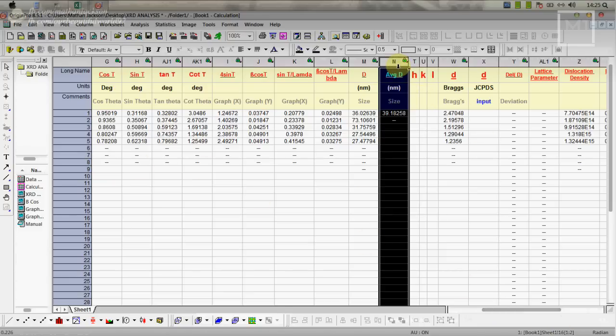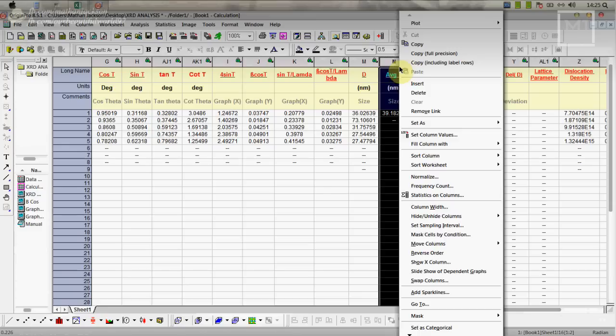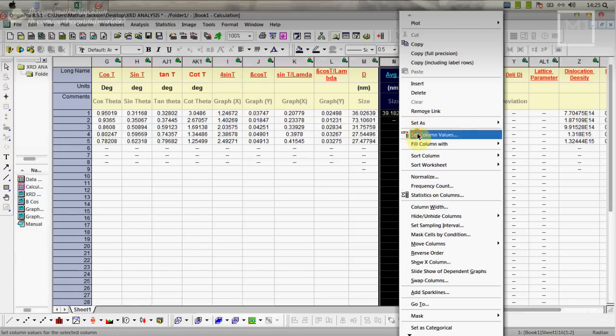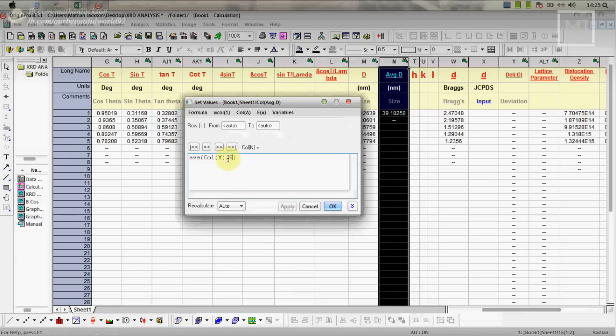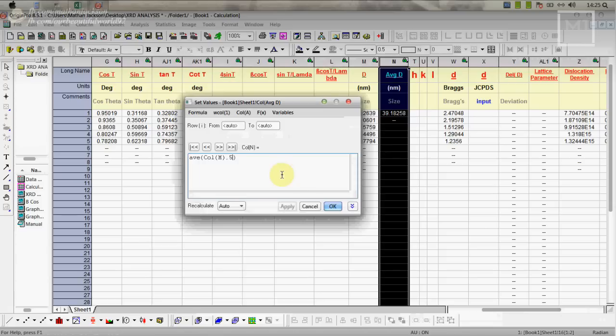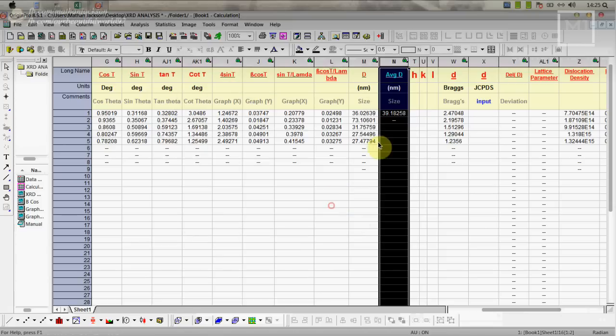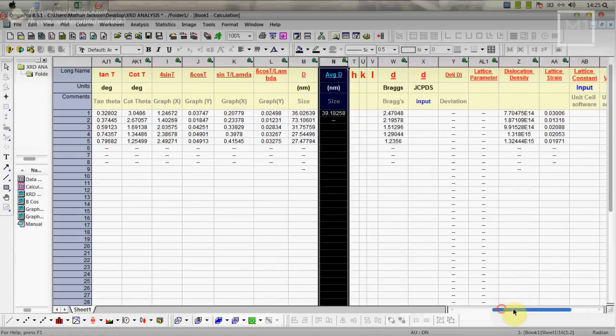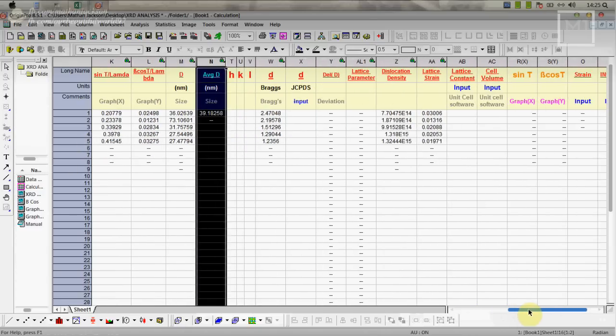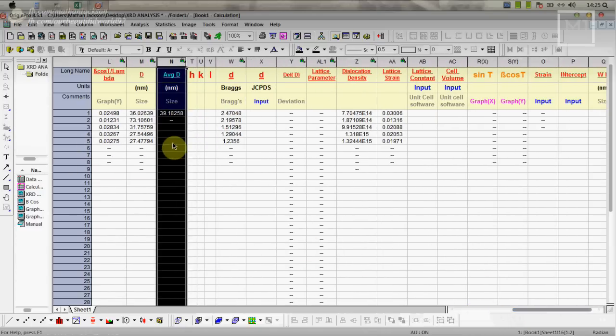Next thing we have to find the average D. This average D is calculated for these five values. If you have more than five two theta values and beta values, you have to select this column, right click, and go to set column values. Here you have to change that one. If you have seven values you have to replace this five with seven. This is basically the N value, how many peaks you are having. You just put that value here so it will calculate according to that.